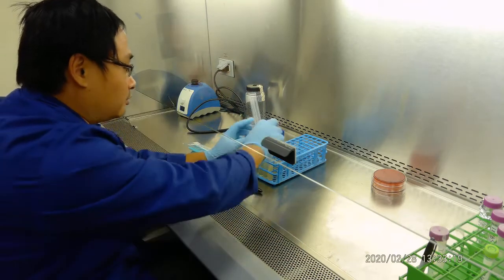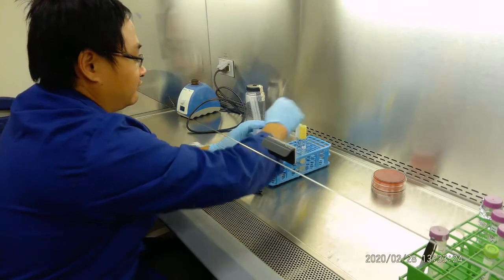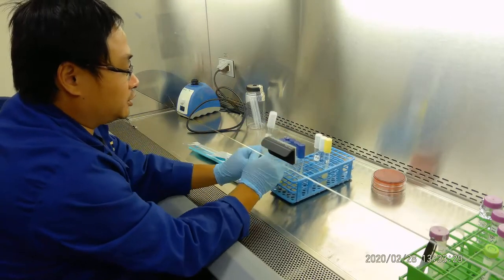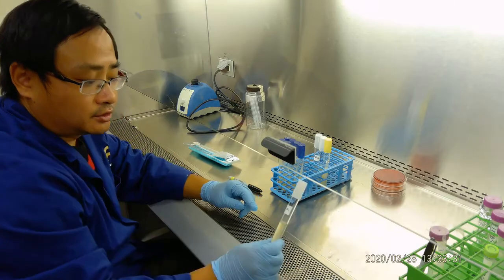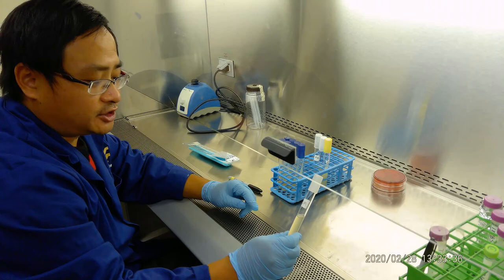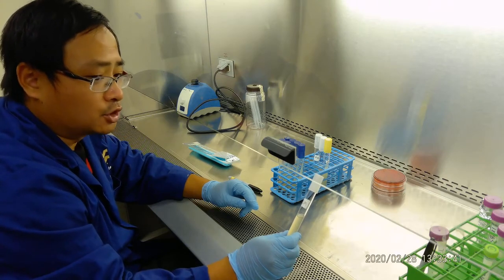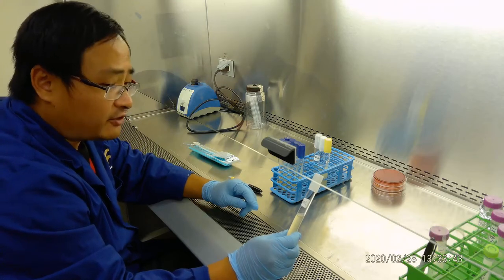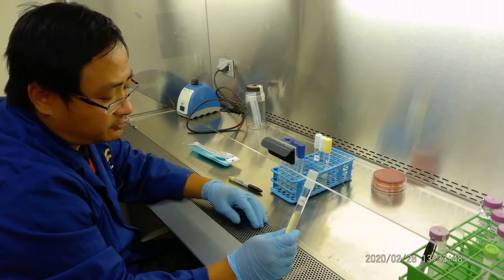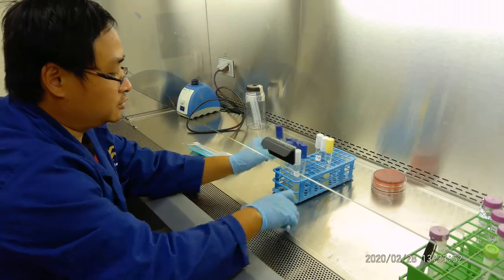Now the second job of what we're going to do is for the bacteria surviving at different temperatures. The first thing we're going to do is Serratia. So let's take a picture right here. Serratia is a very special bacteria. This bacteria will grow at 25 degrees Celsius, showing you red color, and at 35 to 37 degrees Celsius it's colorless. So sometimes they use this as a marker for tracing.